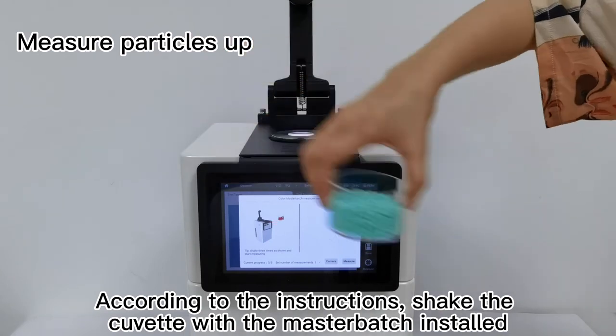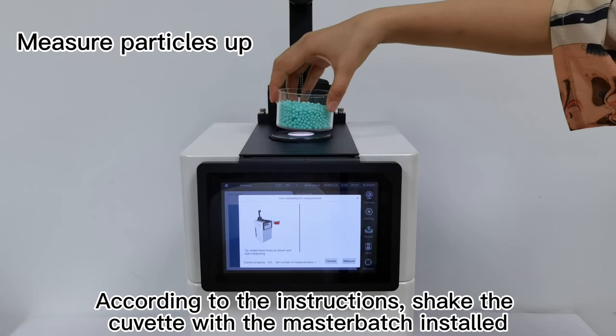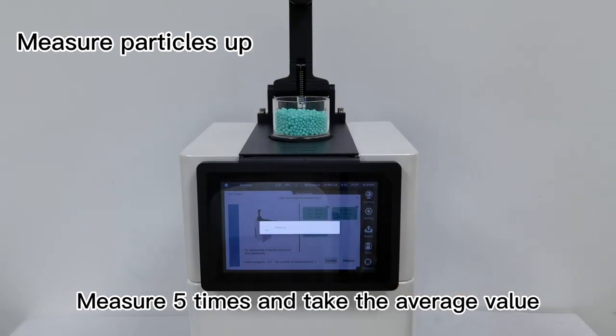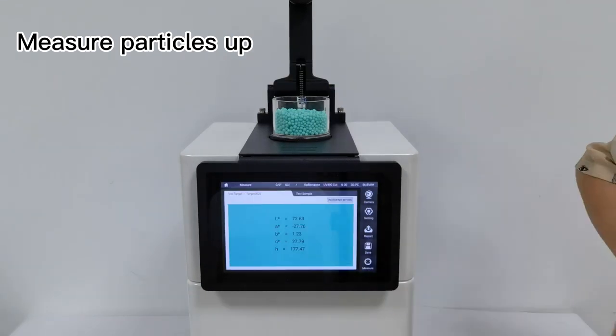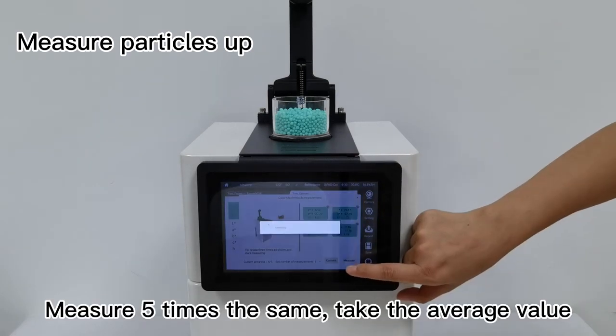According to the instructions, shake the cuvette with the master batch installed. Measure 5 times and take the average value. Switching to sample measurement, measure 5 times the same and take the average value.